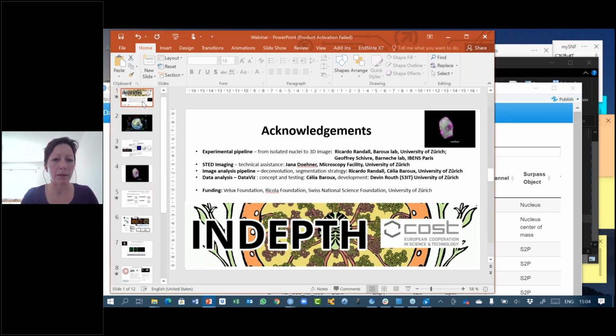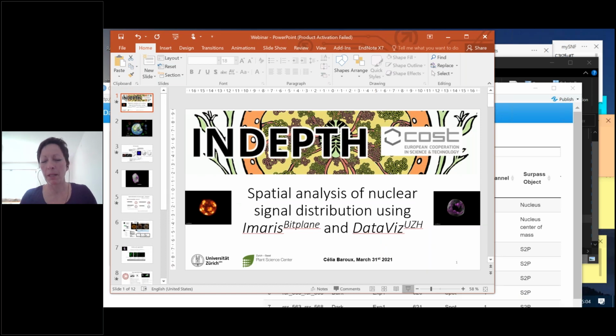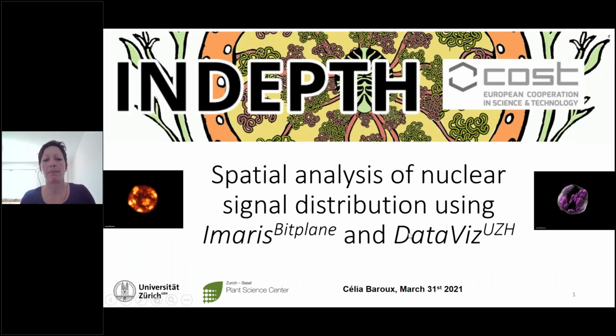So what I would like to present you today is the strategies that we use in our lab to analyze the spatial distribution of nuclear signals. I will try to present it with as many examples as possible, as conceptual as possible, that can perhaps relate to your own work.